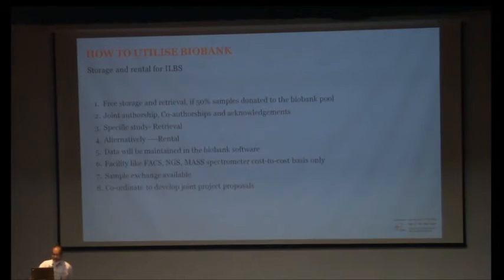Now, for the ILBS students and investigators, how you can store your samples and what is the rental for the samples. Any student who has a thesis protocol can freely store their samples and retrieve samples if you donate 50% of your samples to the Biobank common pool. That will be also used by you later. If you want to use them, you can use them, but you have to pay for them. And if your collaborator or co-investigator wants to use them, then they have to pay the Biobank. And for those samples also, you will get authorship, joint authorship or co-authorship, and acknowledgement.